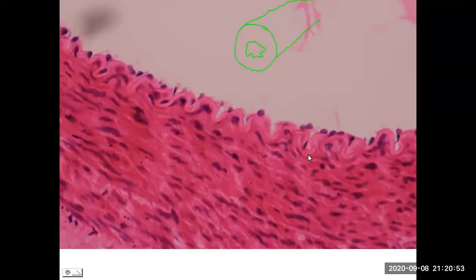We're into lab activity 11, and we're starting to look at histology of epithelial tissue. And this first sample here, we're looking at simple, meaning a single layer, squamous, the flat shape, and in this section, we're looking at epithelial tissue. And we get the full name there, simple squamous epithelium.